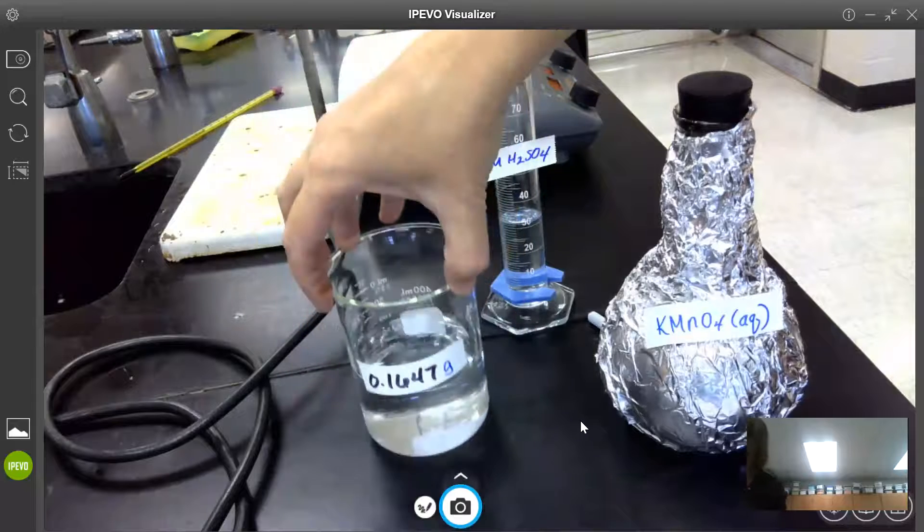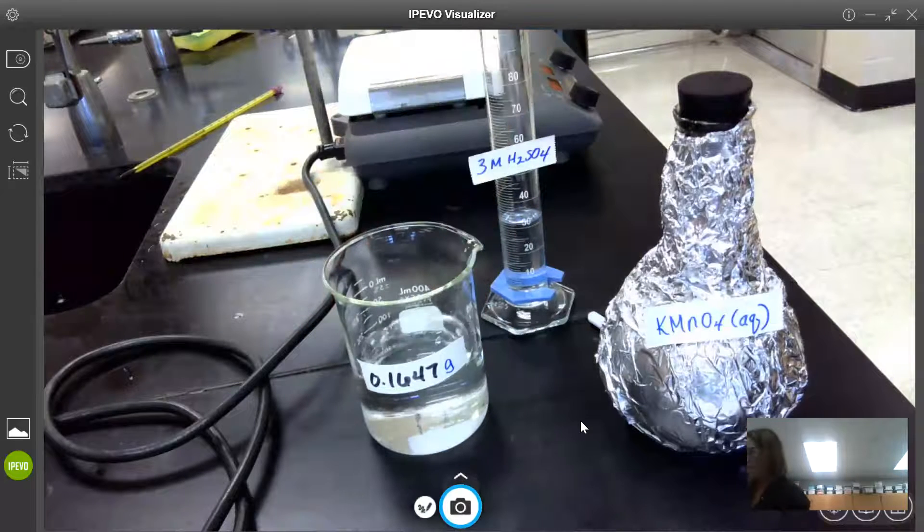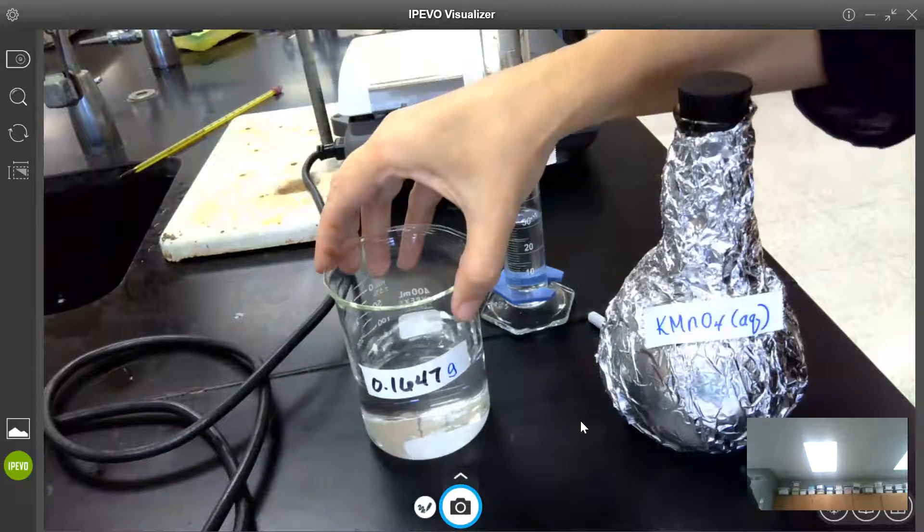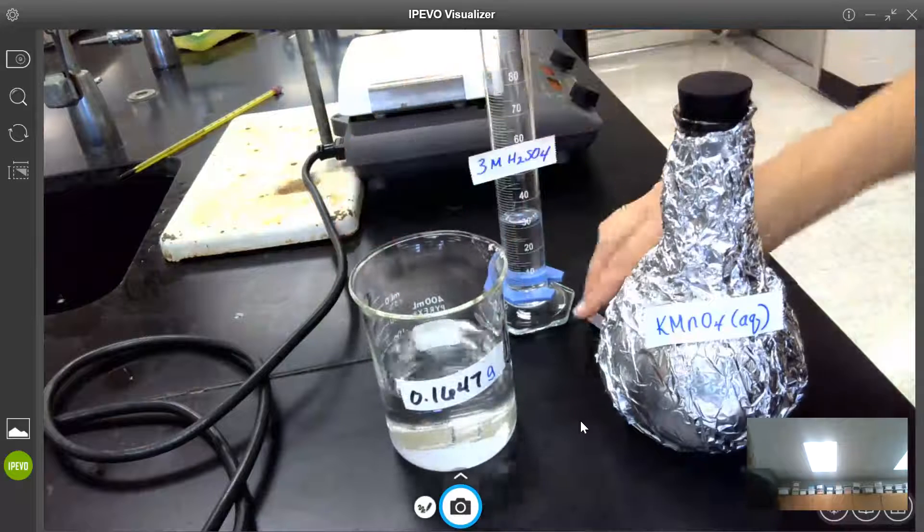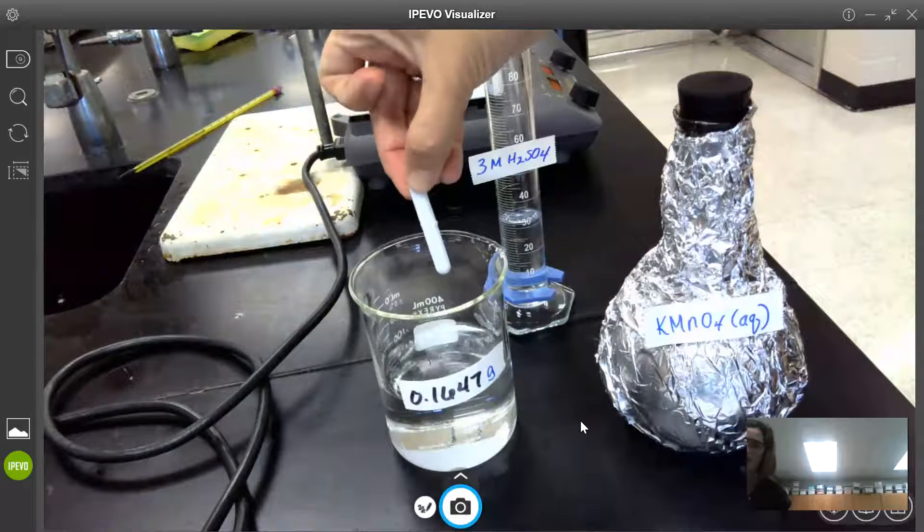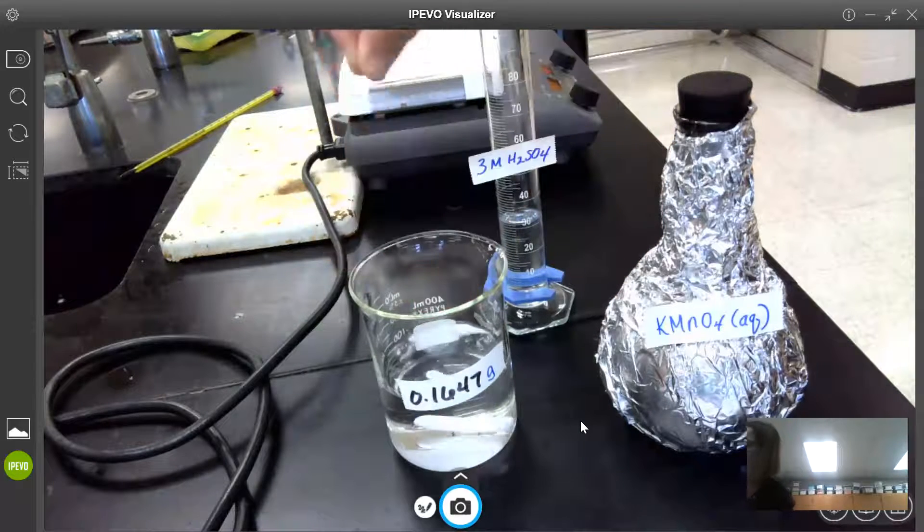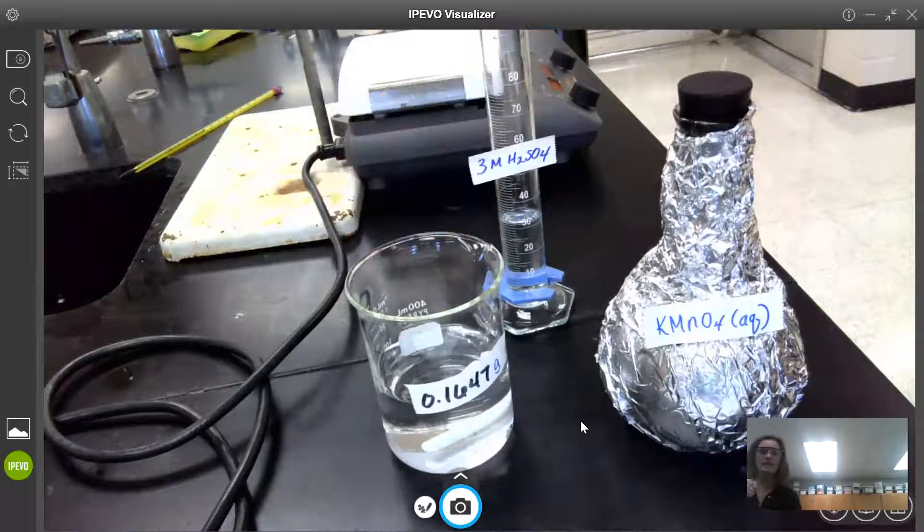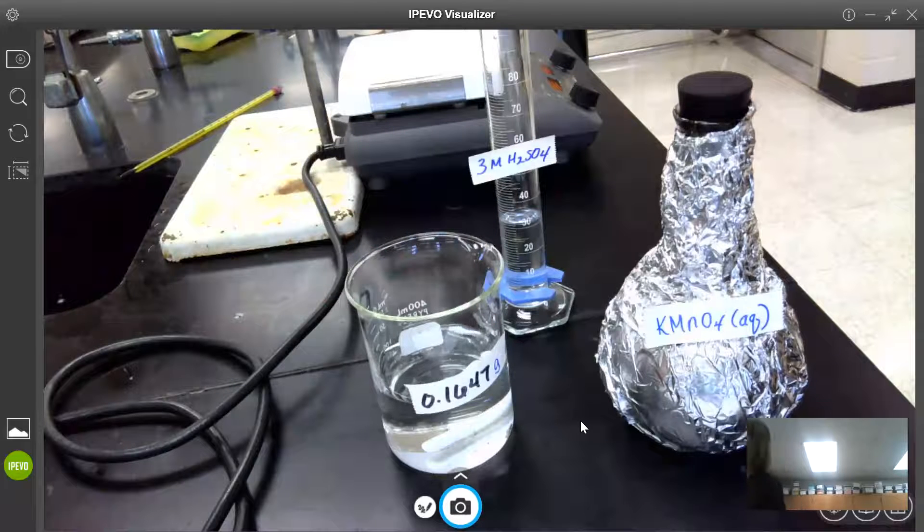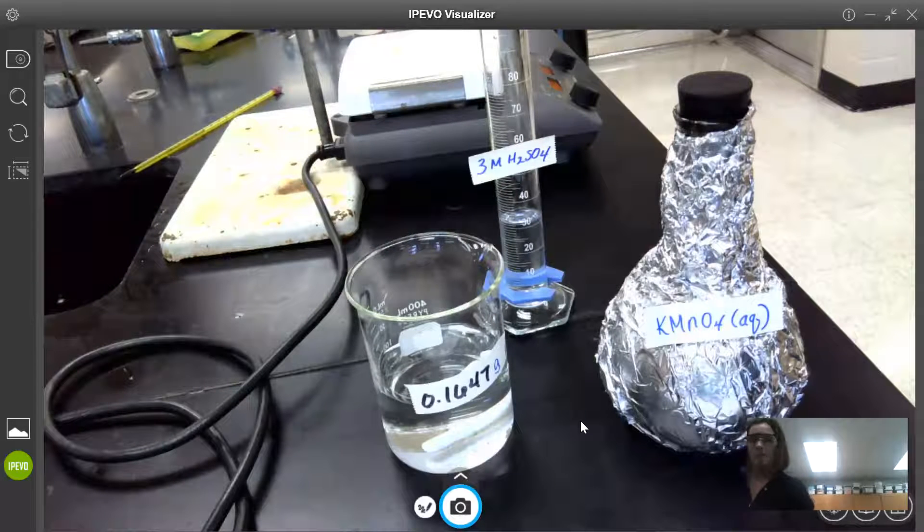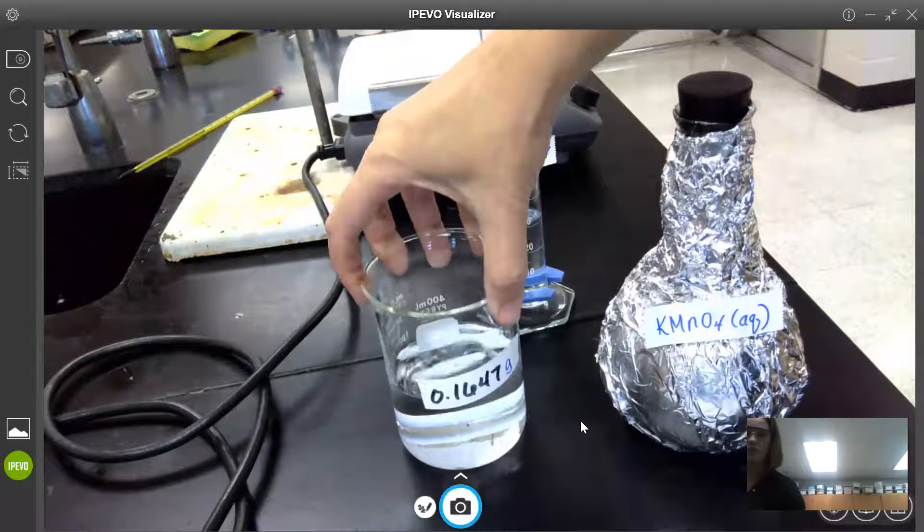You can see that most of the powder in there has started to dissolve in the water and to that I'm going to add a magnetic stir bar and I'm going to place this on a stir plate hot plate in order to begin our titration.